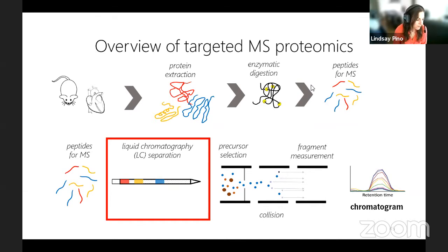When one has quantified 5 peptides of the same protein, but 3 are showing differential regulation and 2 are not showing that trend, how do you infer the results in that case? This is a great statistics question. I'm not sure if some of the other presenters will be going over this, but the idea being, for a protein, all of the peptides should either all be trending up or all be trending down. And in this scenario, you have some peptides that increase, some peptides that decrease.